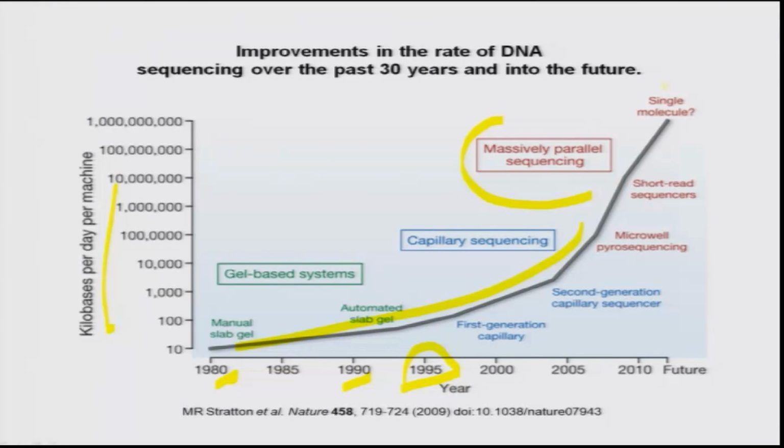Now we are looking at, probably in the future, single molecule sequencing: just isolate one DNA and then look at the transcripts that are made. So one can go and look into that.